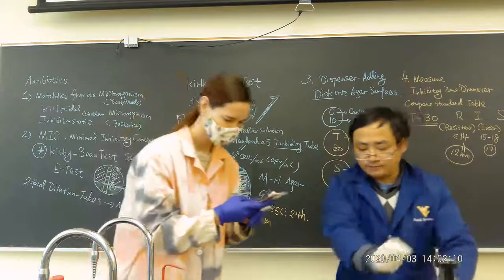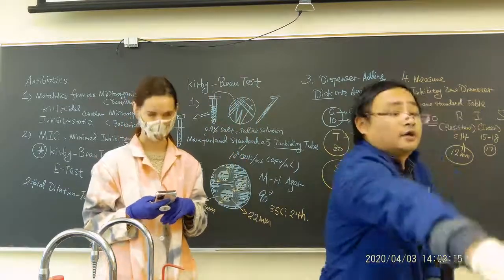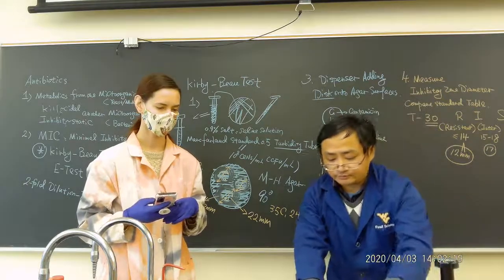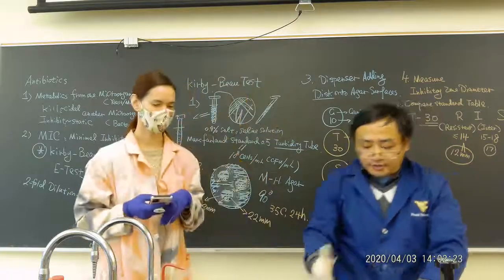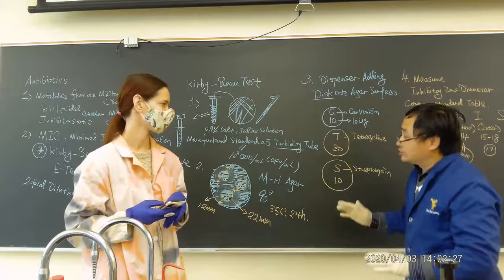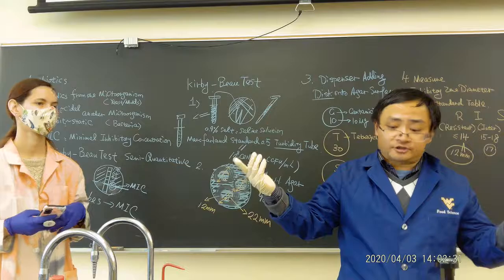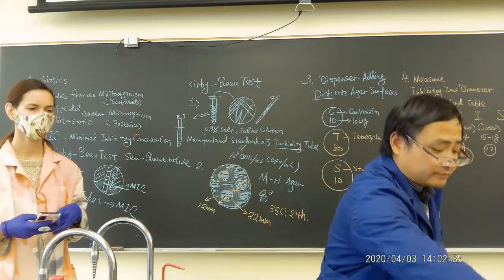You will see 3 antibiotic sticks in there. Can you see it? Then we cover it. You can take a picture of this one. Then we cover it, and then we do the incubation. And after 24 hours, you should see some of the inhibitory zone. You will see it next Thursday, hopefully. Okay, so I just put it right there.